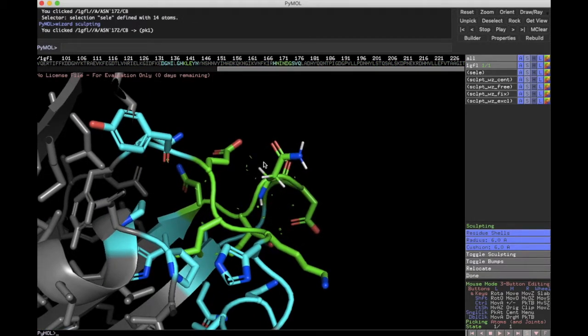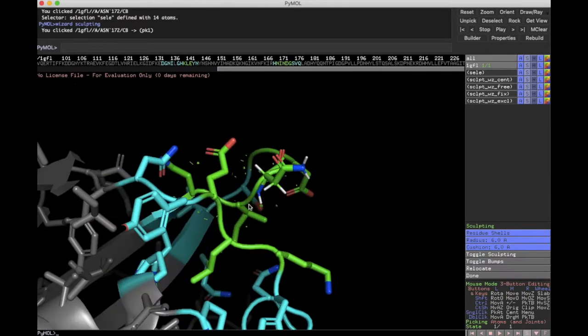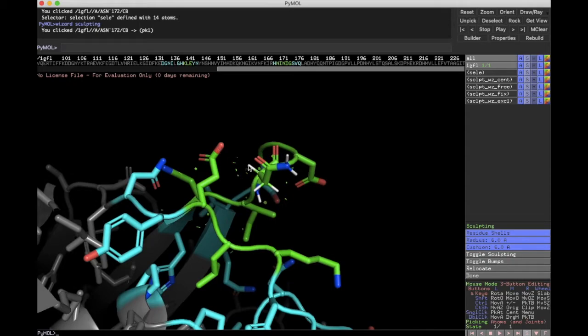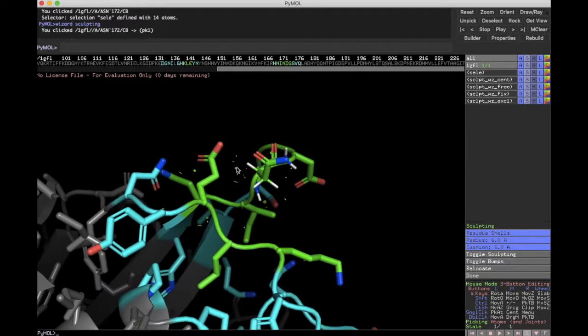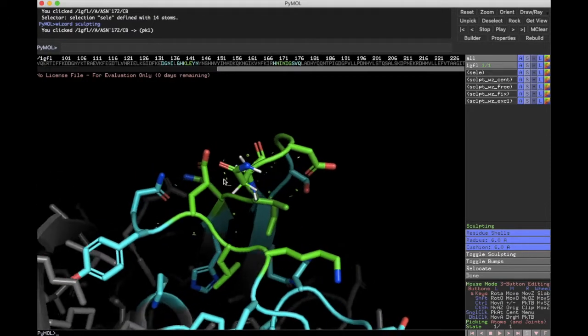And so in this case, I just clicked on sculpting. It asked me to choose an amino acid as the central core, and I clicked on ours, and you noticed it moved a little bit, right? And so technically, that would be some energy minimization. And so you can see here, for example, you've got a hydrogen coming off of the backbone here, and it actually moved so that it's kind of pointing at this oxygen. And my bet is there's a polar contact there, or a hydrogen bond that is forming between those right there.